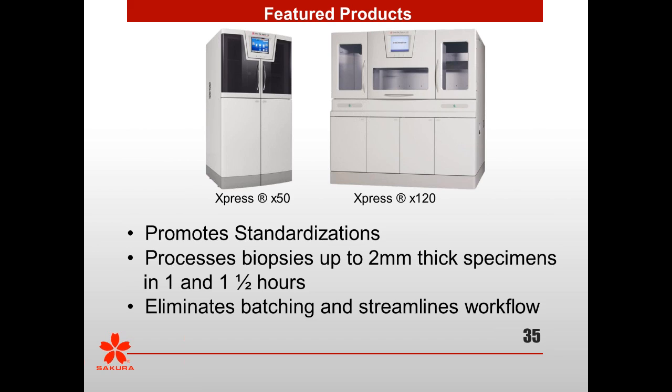So we tend to use the extended, which is the 2 hour. I believe it's actually from start to finish, about 2 hours and 20 minutes. And the standard is closer to 1 hour and 10 minutes from start to finish. Yes, if you standardize at 2 millimeters or less, you can put resection and biopsy tissues together, and you will get an adequately and properly fixed paraffin infiltrated specimen.